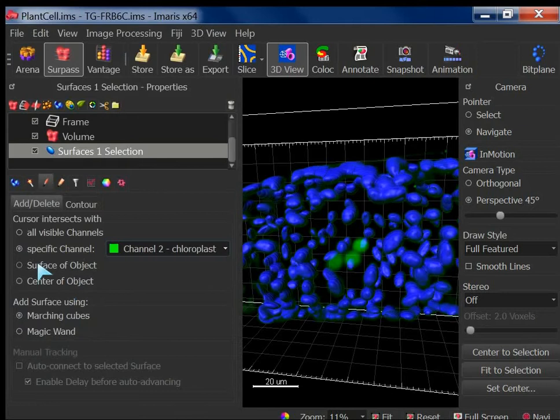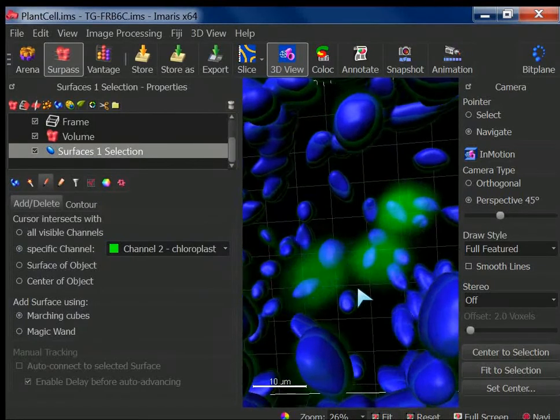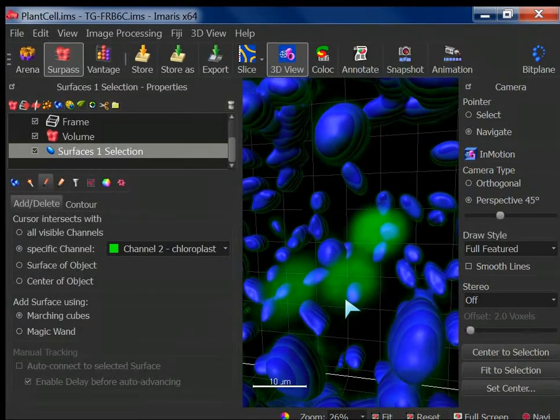So what is so I specific here. I zoom in a little bit so that I can see nicely what is my region of interest. Again, I have to switch to the select mode. And this is this cursor, right, with the variable box size. And it's asking me what is the region of interest that you want to create a surface within.